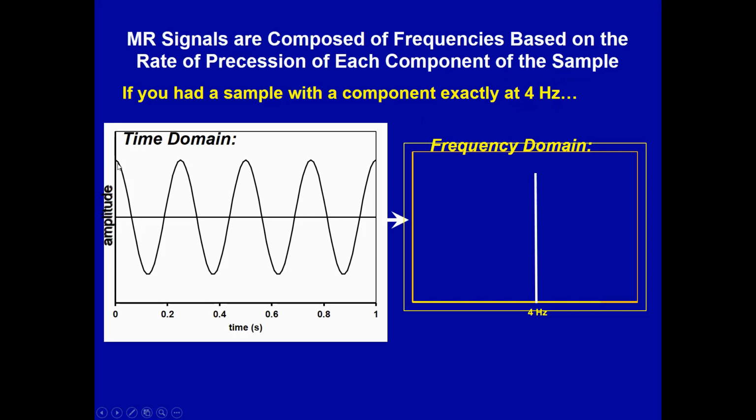You could also measure the distance from this peak to that peak and calculate down here. This is 0.25 seconds. So 1 cycle in 0.25 seconds, that's 1 cycle divided by 0.25, has a value of 4 hertz again. If we want to express that as a frequency, we would say, okay, here's some frequency axis, and right here at 4 hertz, there's a spike. That represents our curve.